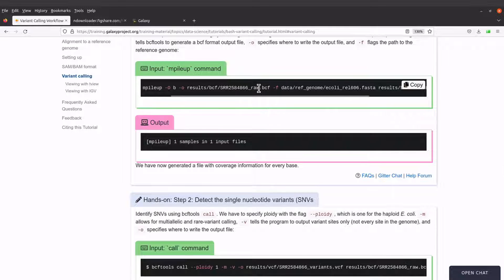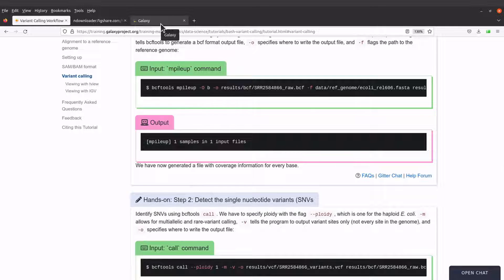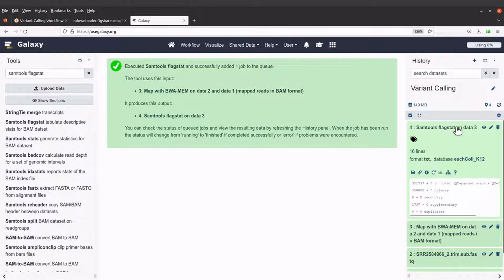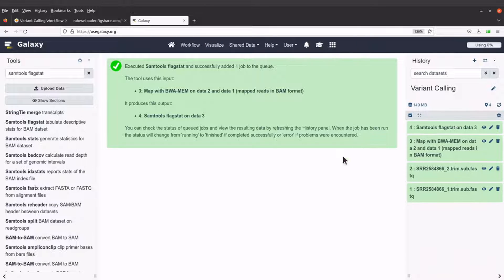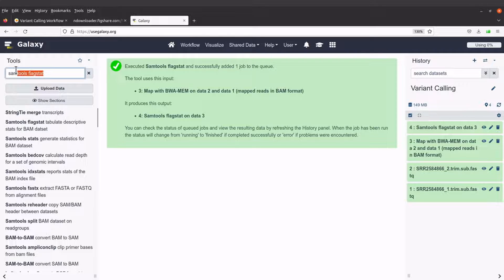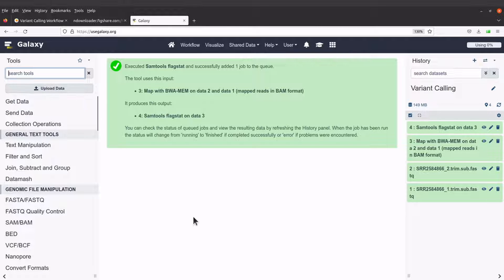So we will go back to the Galaxy platform here. So when you are here you have to search for bcftools mpileup.